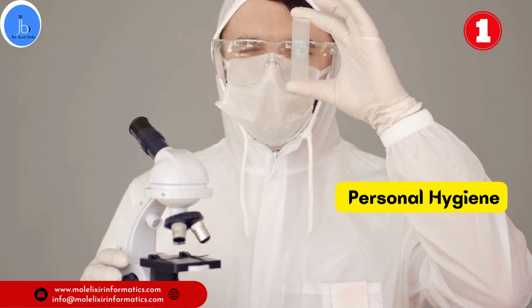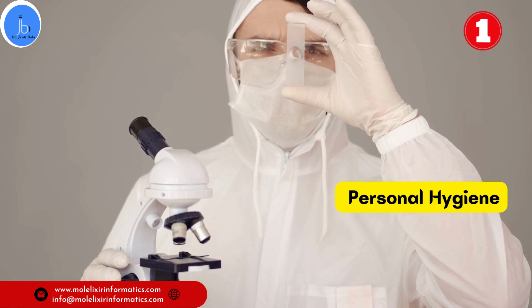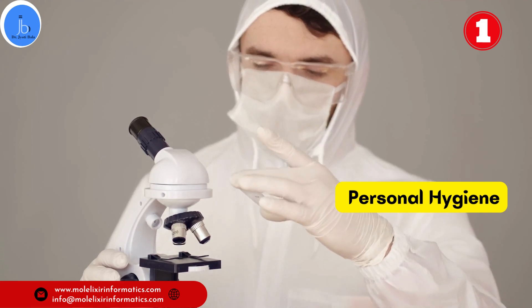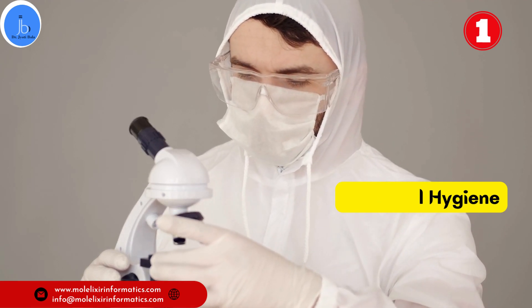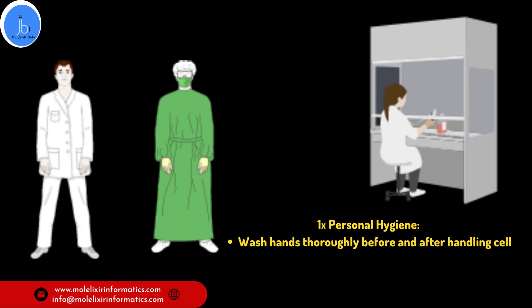It is very important to follow personal hygiene if you are working in a cell culture lab. Personal hygiene is crucial when working with cells. Always start by washing your hands thoroughly before and after handling the cells. This helps to minimize the risk of contamination. Additionally, wearing gloves, lab coat and appropriate protective gear will provide an extra layer of protection.